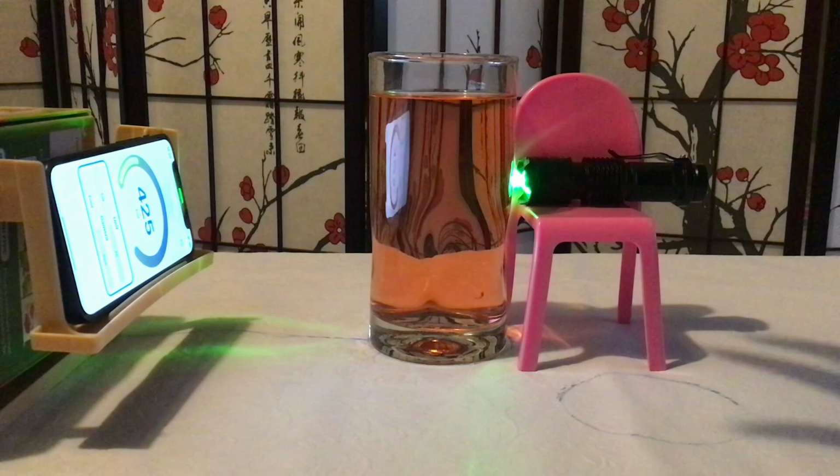In this case, our specific wavelength is green light and the material we identify is red food color, which absorbs green light strongly. For simplicity, we use color water, but in a real spectroscopy experiment, the solutions are often colorless. Scientists use X-ray, ultraviolet, visible, or infrared light to detect unknown substance in a medium.